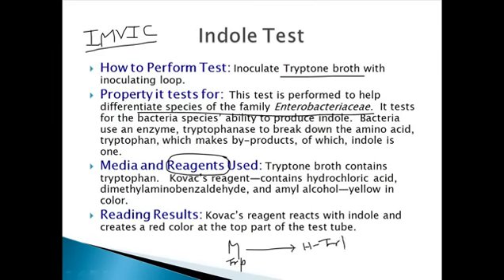So how can we know that this tryptone is hydrolyzed? Otherwise any visible changes occur, because in this kind of reaction no natural coloration occurs. So how can we determine whether our tryptone broth is hydrolyzed or taken up by bacteria for their purposes or not? To do that we use some reagent.